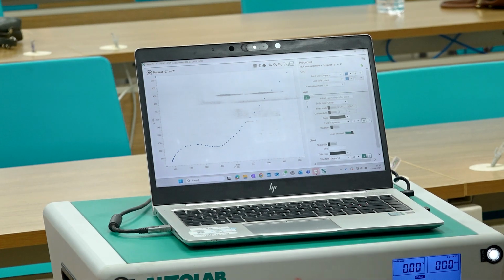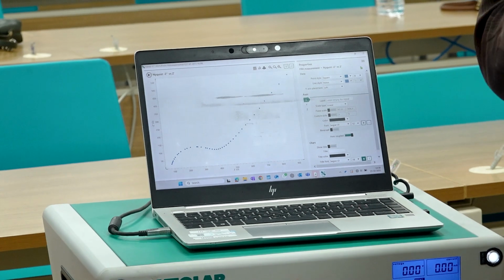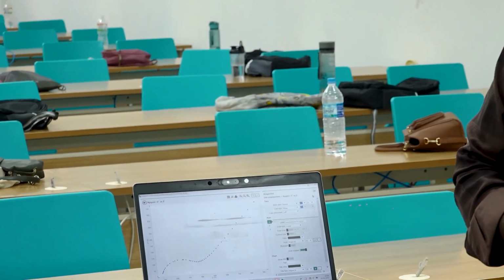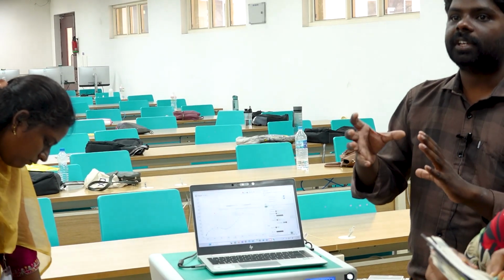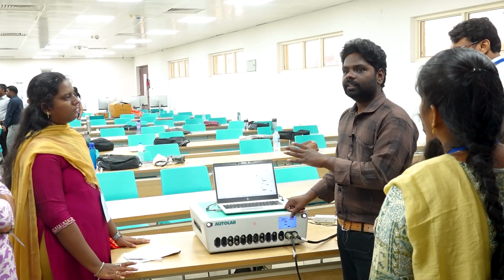This 45-degree line denotes the diffusion property. The name is Warburg impedance. So this Warburg, that means this diffusion, simply describes your electrolyte ions properties. Because electrolyte only has these ions, right? So this electrolyte decides the conductivity, movement of ions, everything. This diffusion property clearly describes that. So whenever you are getting a 45-degree line after the semicircle, you will get a diffusion.